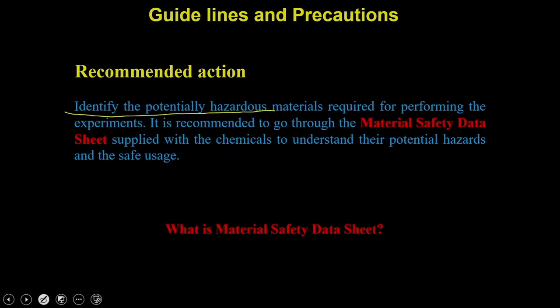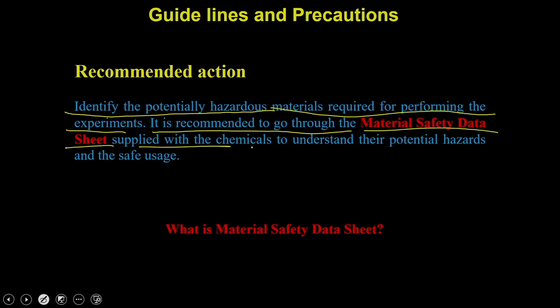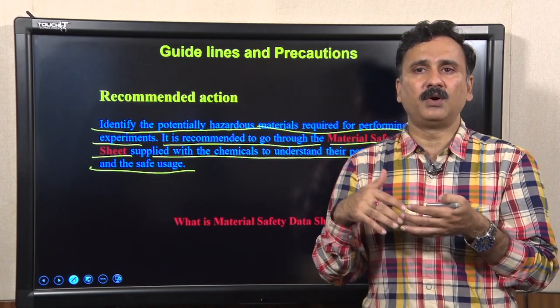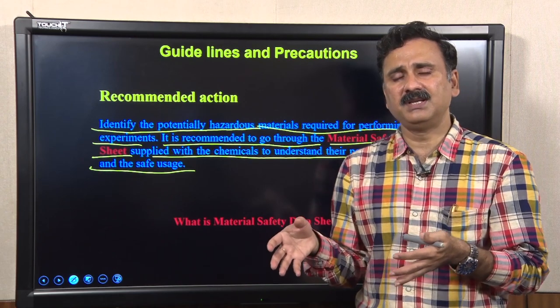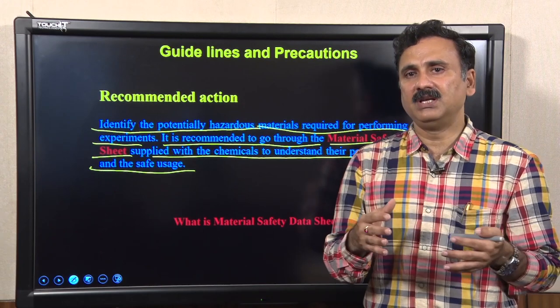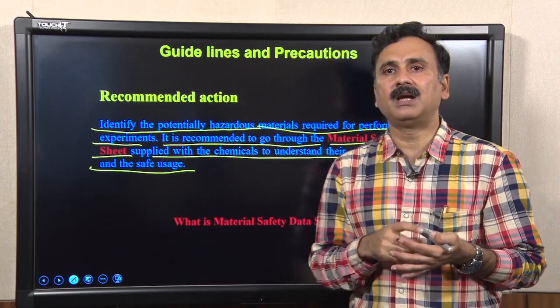Before you start the experiment, identify the potentially hazardous material required for performing the experiments. It is recommended to go through the material safety data sheet supplied with the chemical to understand its potential hazard and safe usage. Before you open the container, you need to know what chemicals are required and read the material safety data sheet.